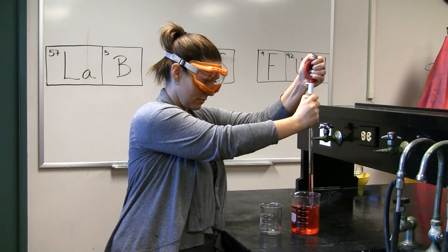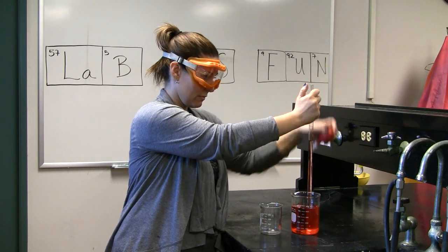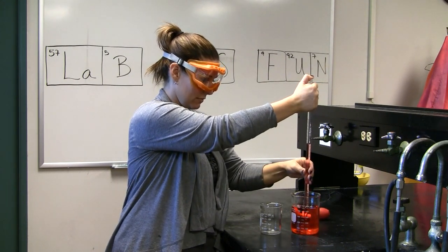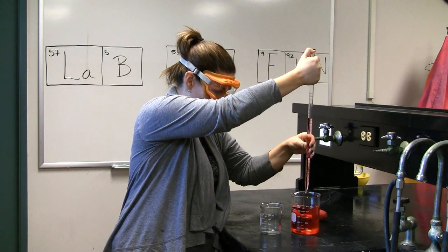When you have drawn up enough liquid, replace the pipette bulb with your index finger or thumb. From this point on, use your finger to control the flow of liquid into the receiving container.